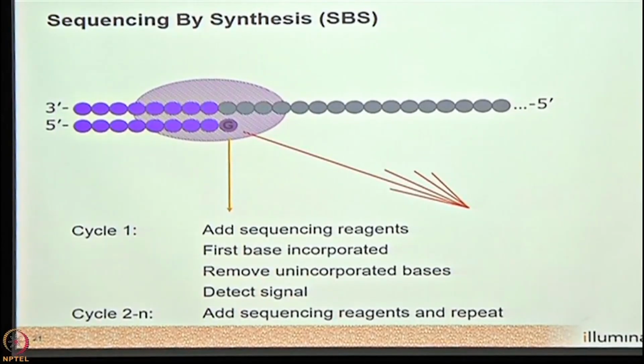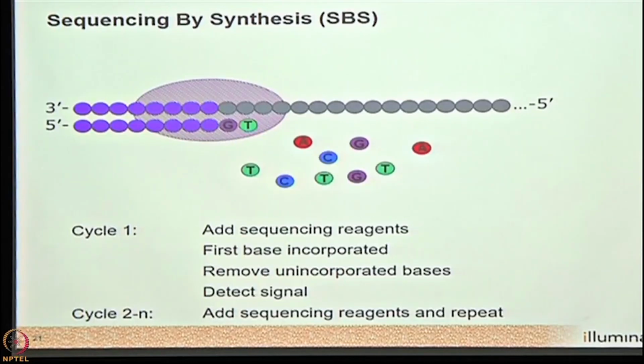So let's say you are running a sample of 300 cycles. So 300 bases will go and bind. This is your one fragment. Okay. So this is how, if you are going for 300 cycles, 300 bases will be added and we are done with the sequencing part.